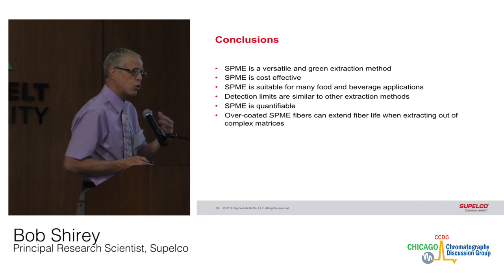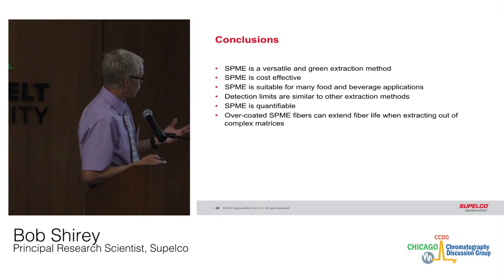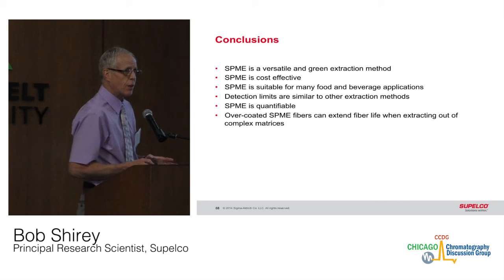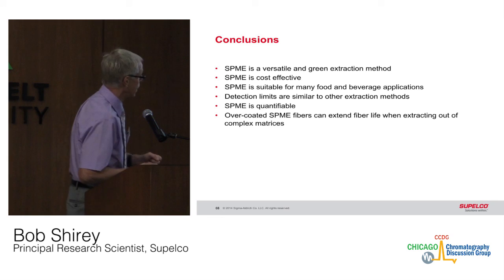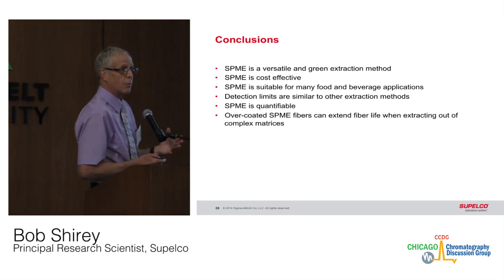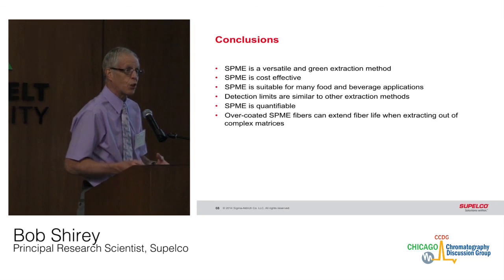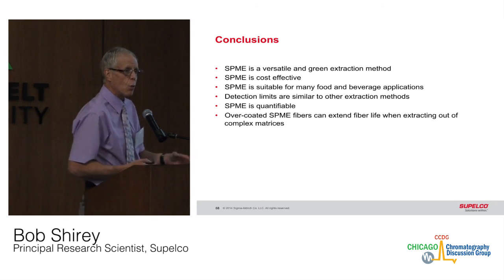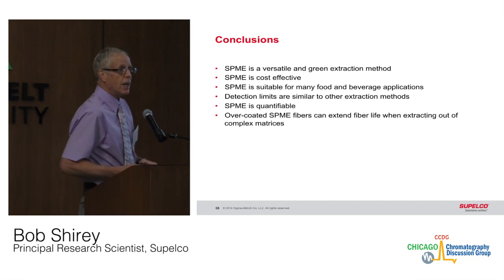We've looked at other matrices, including baby food, spaghetti sauce. We found that you can reduce matrix interference by heating the samples. Usually when you do direct immersion, you don't heat the samples, but we found that heating at 50 degrees greatly improves that recovery. You want to make sure your sample is thoroughly mixed, especially if you're spiking standards into it. You want to make sure it's thoroughly mixed and thoroughly dissolved in there.